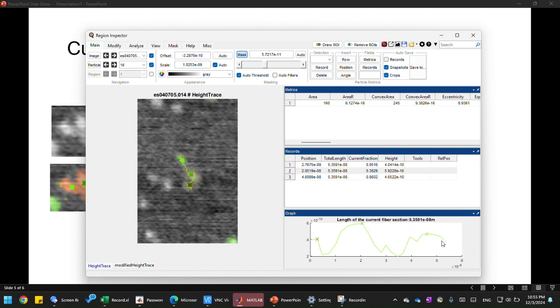Okay. Now it adds another column called relative position. So it calculates the position between the three peaks, which generates two segments, right? You have three domains, you have two segments, two arms. And the first row, I just treat as 0, so it's meaningless. What we need to take care of is the second row.